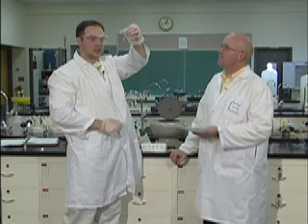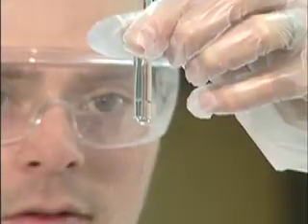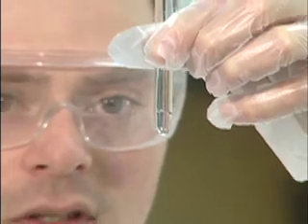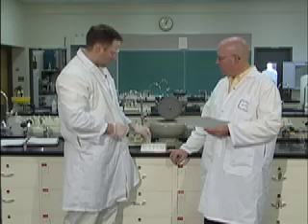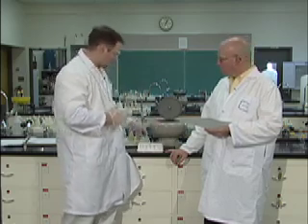I see flocculent level right there. You see a flocculent precipitate forming in the middle. Okay, so now we know we have 3 cations in this solution. We've got aluminum, we've got iron, and we have silver. Right. The last test we're going to do is a flame test.